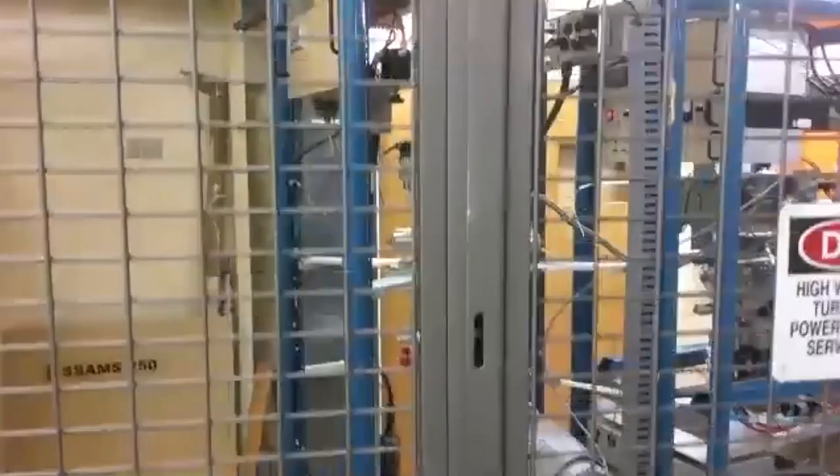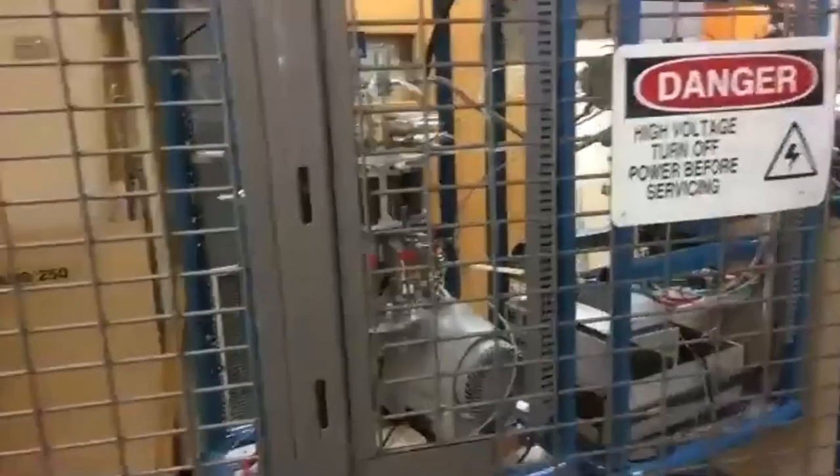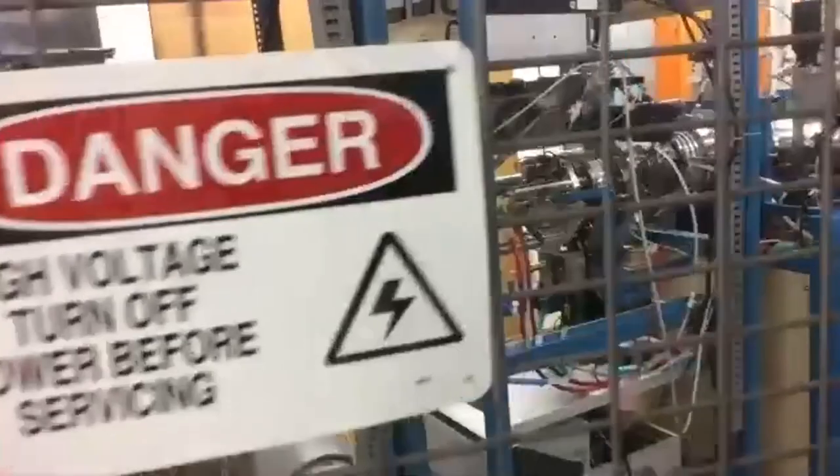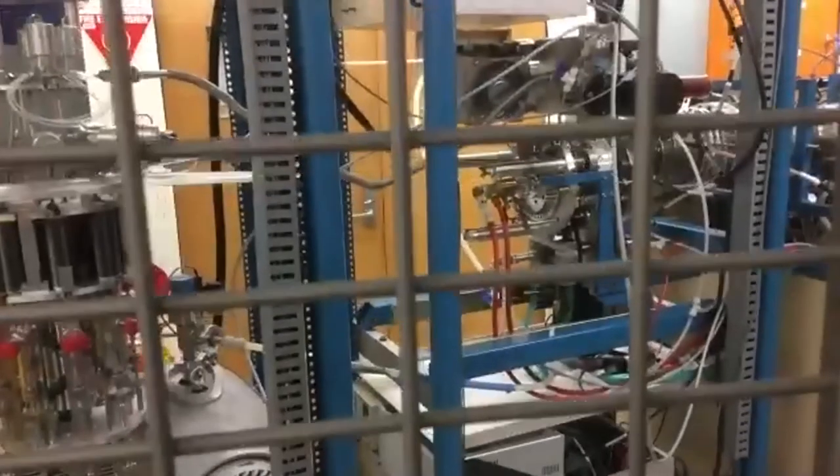So this is our accelerator mass spectrometer. It's noisy because it has lots of vacuum pumps. But basically, we put our samples in there, and then the ions get accelerated. We measure the different isotopes, carbon 12, 13, and 14, in the accelerator. So that was just a quick little tour.